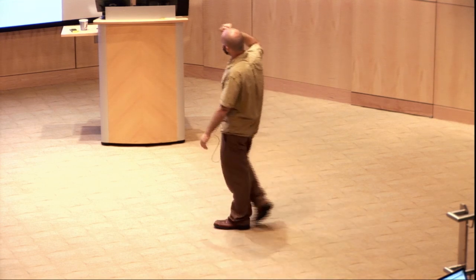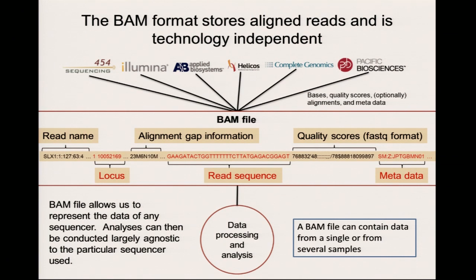There are tons of metadata fields that an aligner could populate to tell you more information about this read. The one we're showing here is very important because it tells you which lane the data came from. Remember, knowing about the specific errors per lane is very important, so you have to associate every read with the lane it came from. There's tons of metadata to let you know where it came from, so you know which error model to apply to this read, because you know it came from a certain lane that had a certain error.